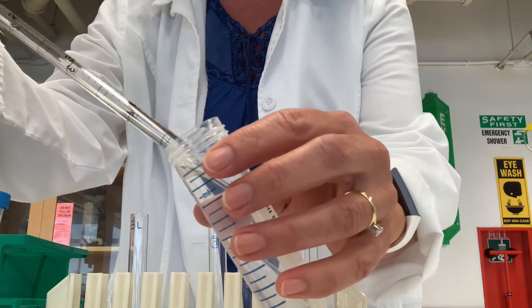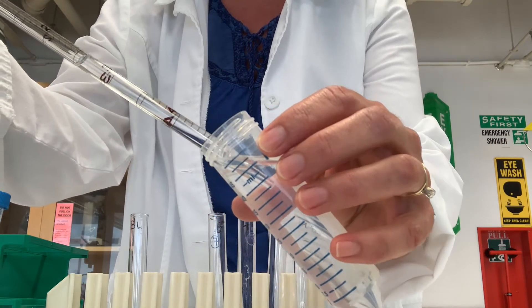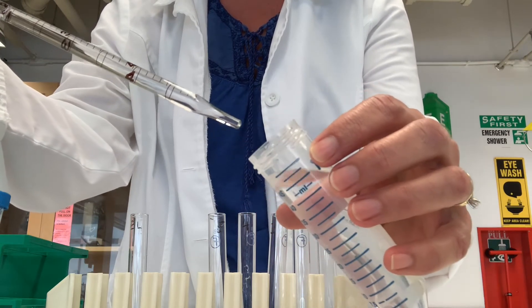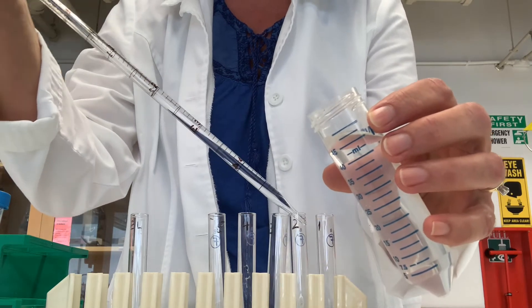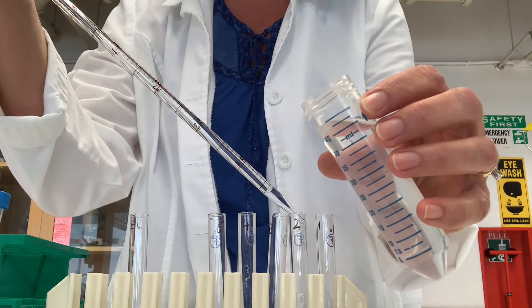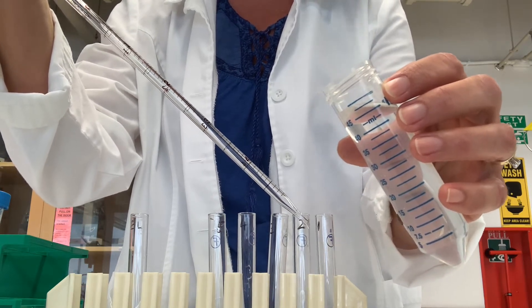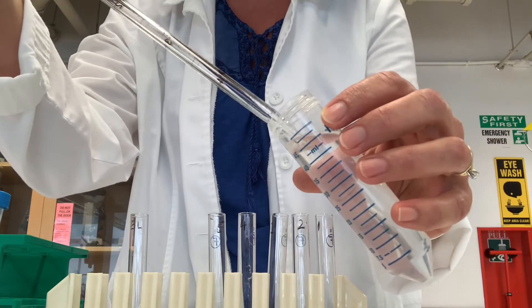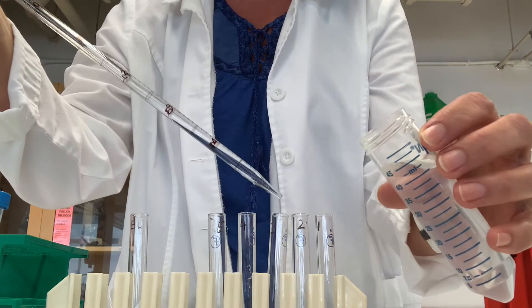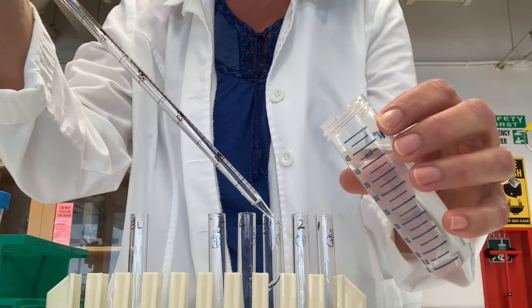I will insert the tip into our water. Notice I'm drawing the liquid up to the two milliliter mark. Remember, these are graduated backwards, so to get three milliliters of liquid, you have to draw liquid to the two mark. Here's the first three milliliters.